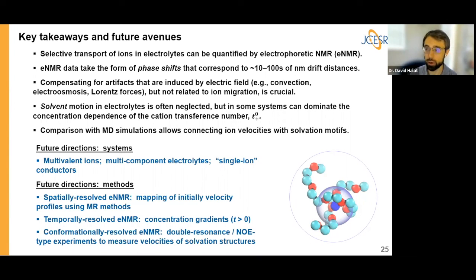Everything is very viscous, so the velocities become small and difficult to measure. One of the things that we are doing now is to move to stronger gradient systems where we can apply much stronger gradients and actually detect a phase shift, where we should be able to see that. So stay tuned. We hopefully have some new PFG equipment that will enable that.